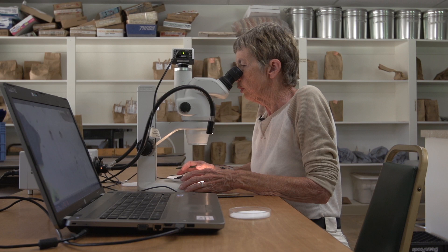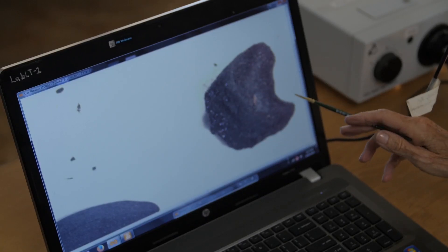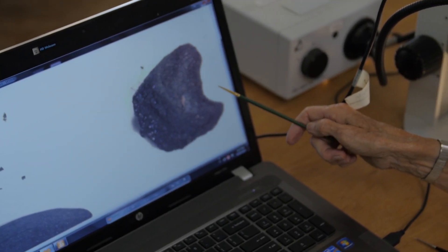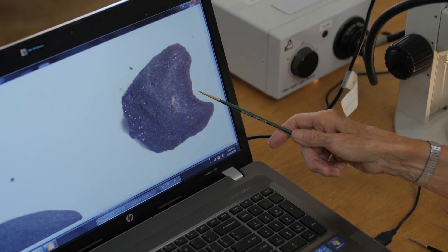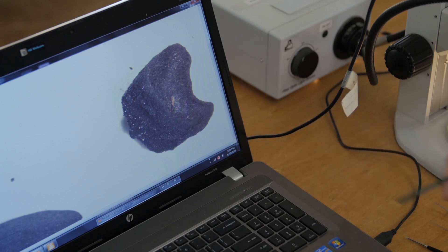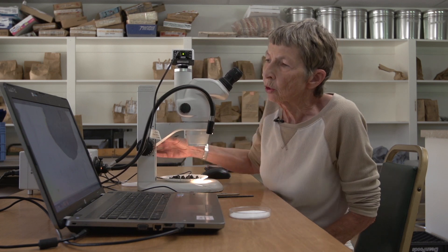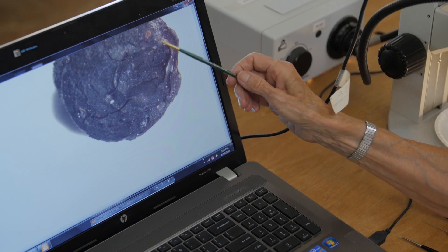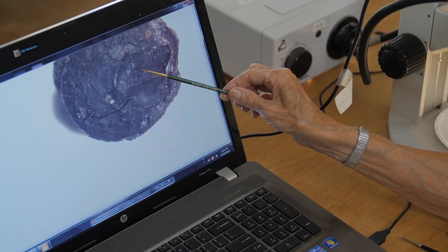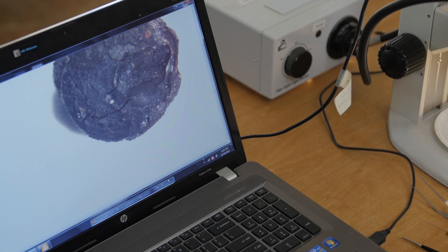What I'm really looking for are reproductive parts and I've come across a couple. This one is a little cupule — it's a pocket of a corn cob that was probably used as a fuel source. This was not eaten; this is the leftover cob after they've taken the kernels off, and that would have been tossed into the fire to help get it started. This large one at the top of the screen is actually a corn kernel. I can see the embryo depression — it looks just like a corn kernel of today. This one accidentally got burned; they may have been parching it for dinner and it popped out and fell into the fire. So we actually have the kernel as evidence of the food product they were preparing.